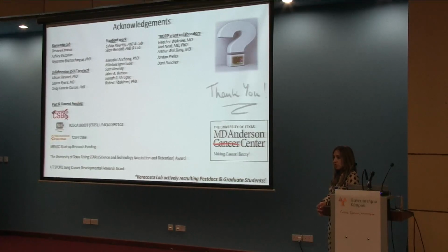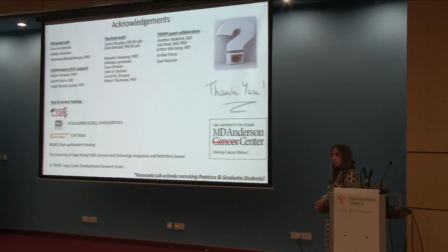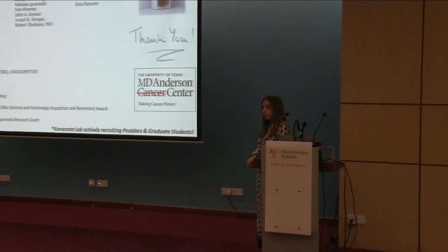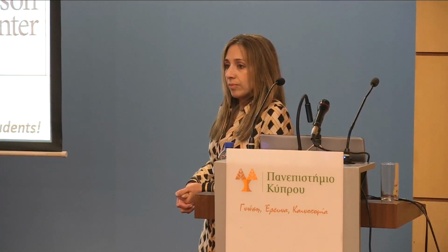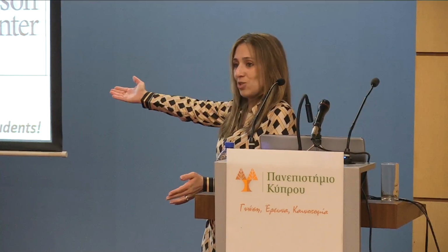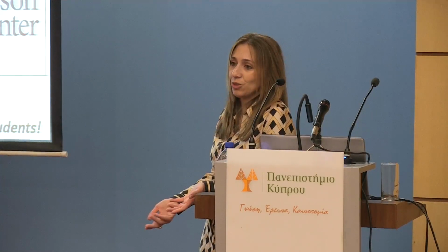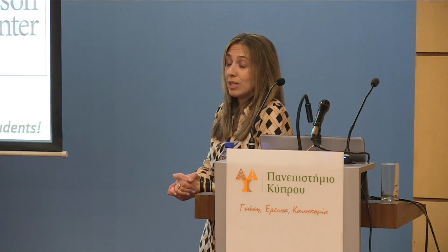You mean the pleural effusions? Yes, pleural effusion, and also you have used blood specimens. Have you used this technology with adjuvant patients, lung cancer patients, or breast cancer patients? All I've showed today is lung cancer. So in the context of the non-small cell lung cancer, which was the previous study before I started my lab, it was either treatment-naive patients, solid tumors, or advanced patients that we took the pleural effusions, because as you know, it's hard to get metastatic tissue from patients that have undergone therapy.